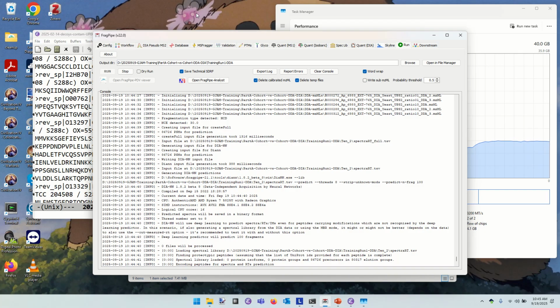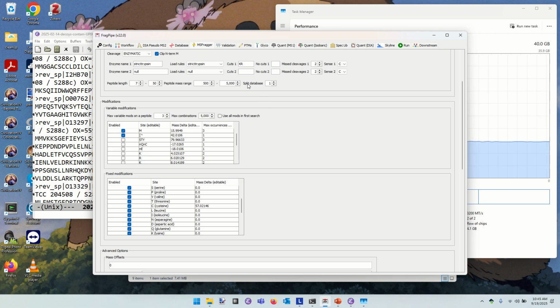If you're running low in memory, you could also try splitting the database. That's true. I think that decoy is enabled by default. Decoying, I don't think it's yes, but finally if you split the database, it runs multiple searches and then concatenates the output at the end. Okay. So you need less RAM to run the individual search. Yeah, is that option covered on the MSFragger tab? Oh, split database right here, sure. Okay. Increase that to like 4. Yeah, that would make it do the search in multiple passes. Oh, this is on the MSFragger page itself. Good suggestion.